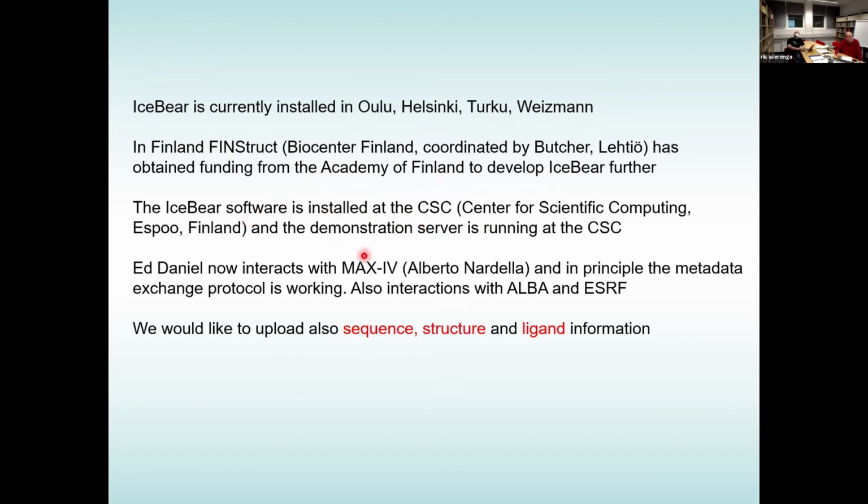The idea is to generate a cloud service, and it's already partly working. For example, a demonstration server is running at CSC. We now also have interactions with MAX IV, and this week a successful upload of metadata has happened. There are also interactions with ALBA and ESRF.